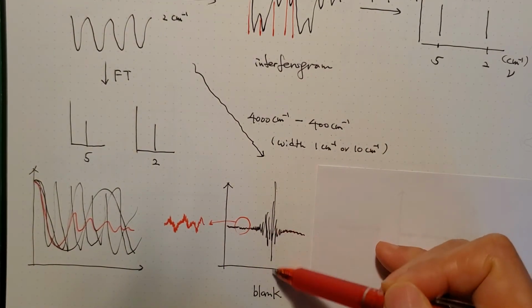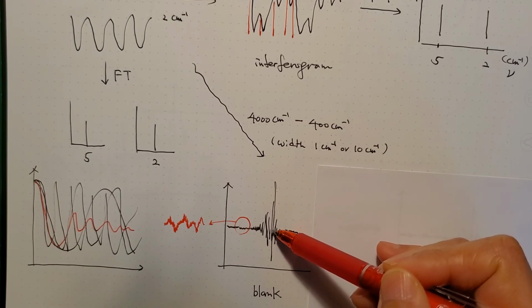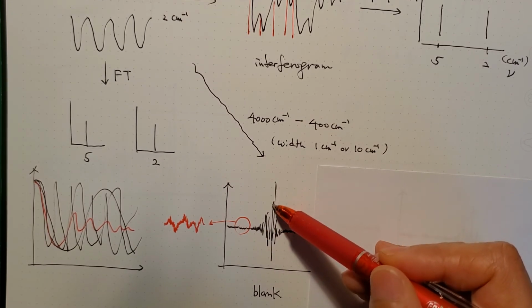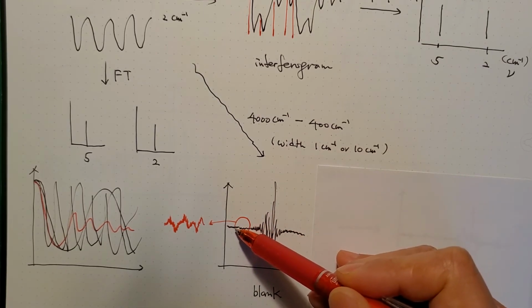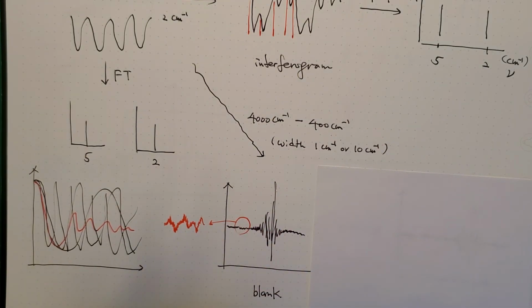Near the mirror, having the same distance from the fixed mirror, you have the most intensity, but as the mirror goes closer or away, symmetrically the intensity decreases. But inside of this, you see little spikes, and that will eventually be able to transform into many original wavelengths.